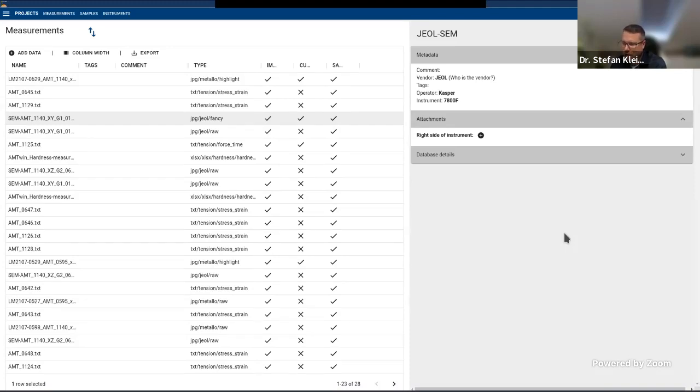And he wants to know if there's a possibility to use, for example, Omero for images for storage and analysis tools (in brackets, Fiji). Also, is it possible to implement it? Fiji is ImageJ, right? Isn't that another name for ImageJ? I'm not 100% sure, but I thought so as well, yeah.